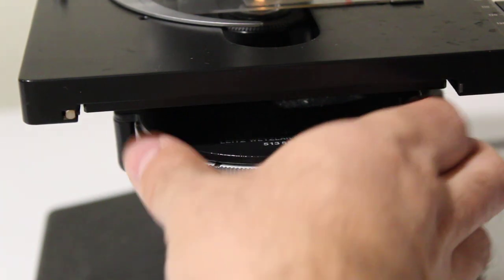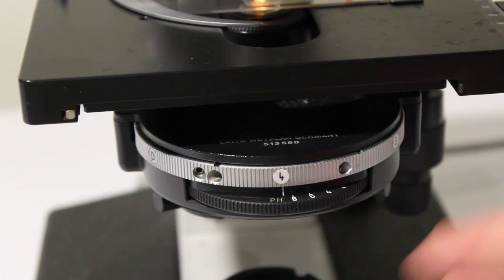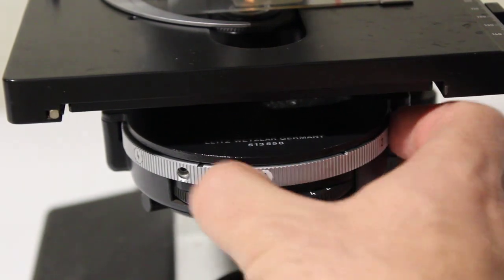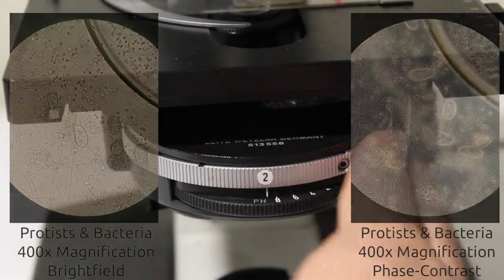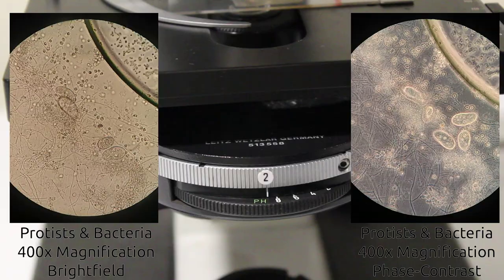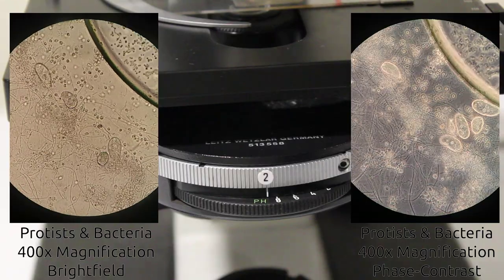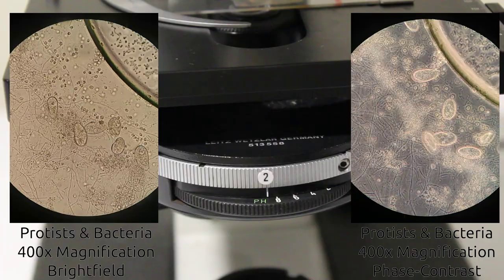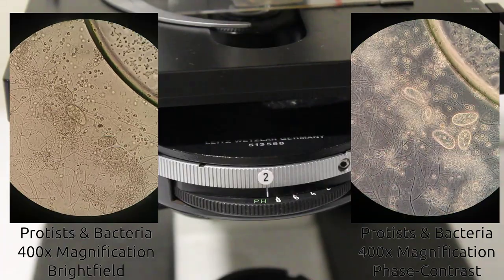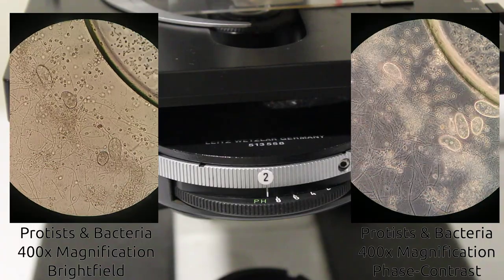The main advantage offered by my condenser are the phase contrast settings and there's actually four different phase contrast settings built into the scope indicated by these different numbers. Phase contrast is a way of amplifying those differences in refraction to make more contrast in your image. I'm not going to go into the physics of it but phase contrast can really help to bring out smaller structures like bacteria as well as intracellular structures in yeast like their feeding vacuole.